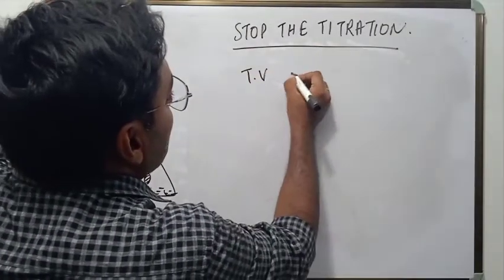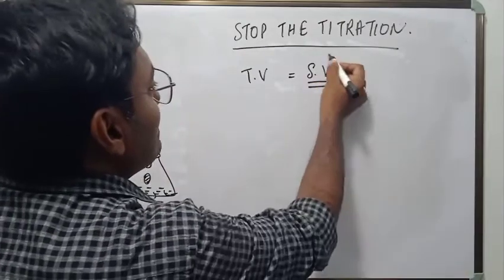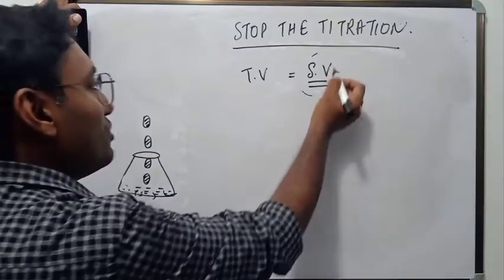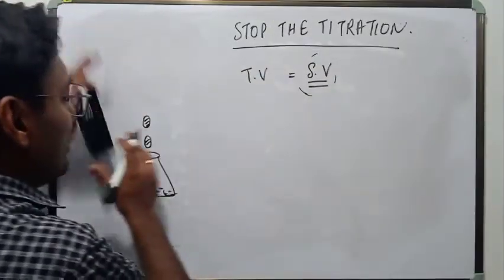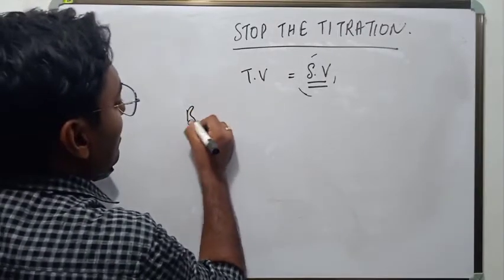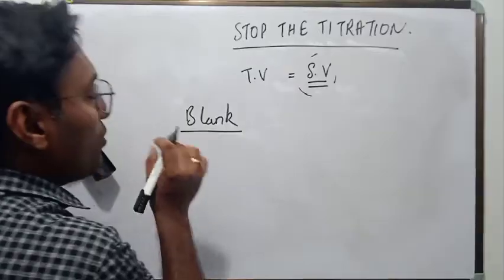I would say that is the sample value. I will name it as sample value because that is the value when a sample of oil or fat was present. Note down that sample value. Similarly, you go for determination of blank. Conduct a blank titration. So in blank you would not use any oil.